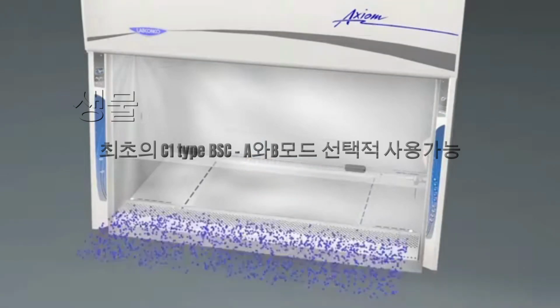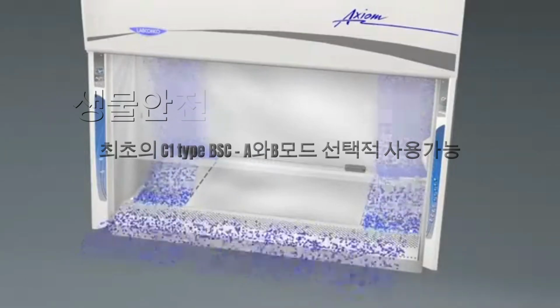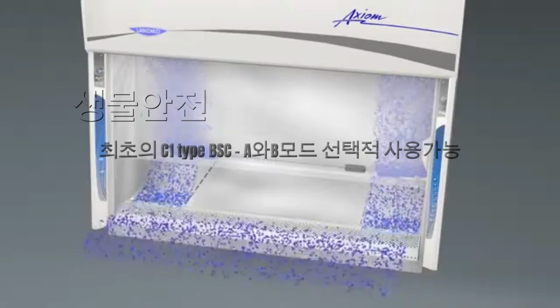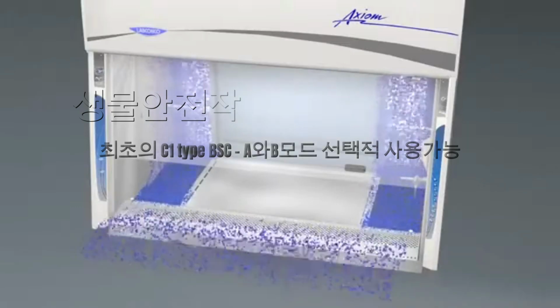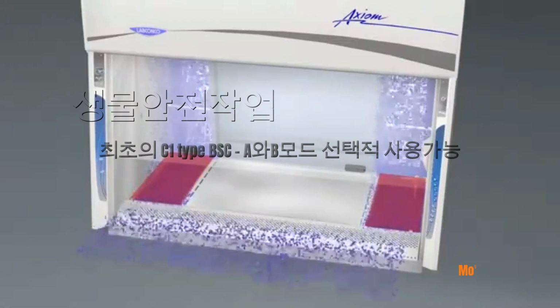Personnel protective air flowing into the cabinet and downflow air flowing over the side surfaces of the interior, colored blue, are recirculated through the cabinet's supply air system. Chemical vapors should not be introduced in these airflow areas.